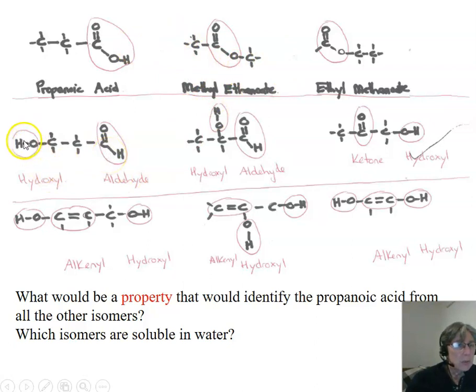This would be soluble with the OH, and this would be soluble with OHs on each side.